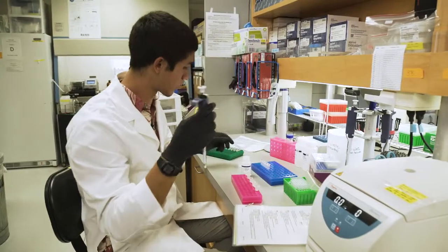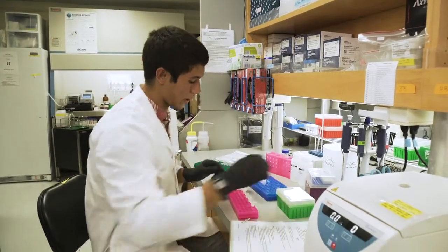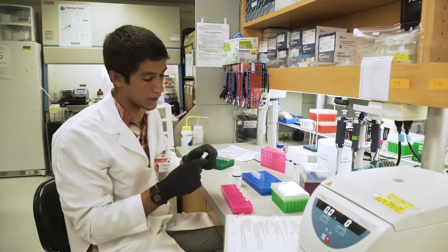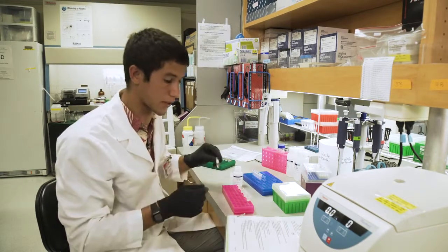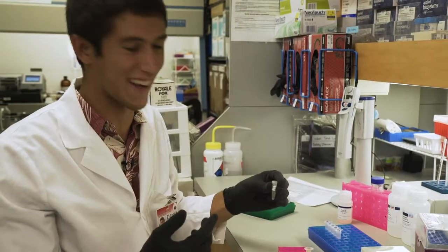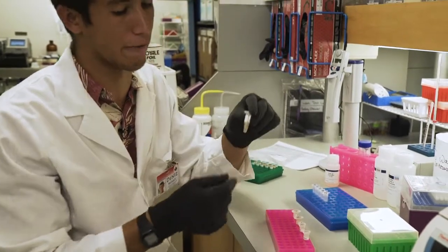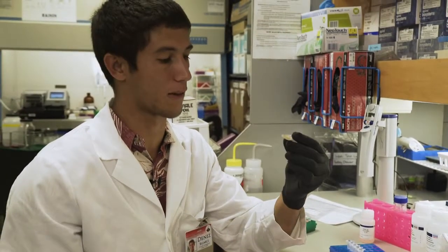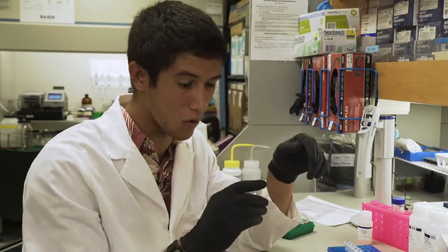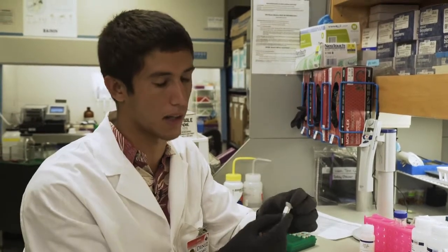Right, and so now that that buffer AL has been added, we actually have to let it sit for just a little bit, only for a couple of minutes. After this, we start adding in more buffers and things like that. Now that we added the buffer, we do what's called mixing by inversion, and that just means flipping it upside down slowly and then flipping it back the other way slowly. If you shake it a whole lot, you'll end up damaging the DNA. So that's why we do mixing by inversion.